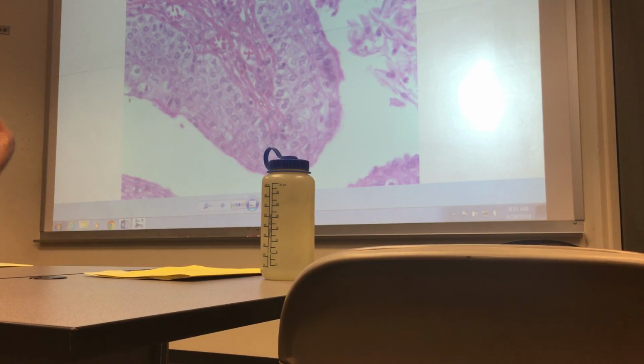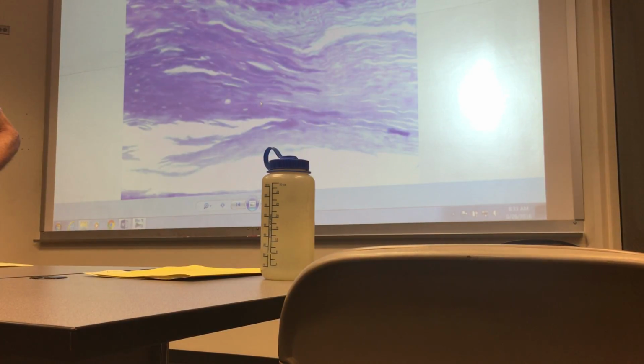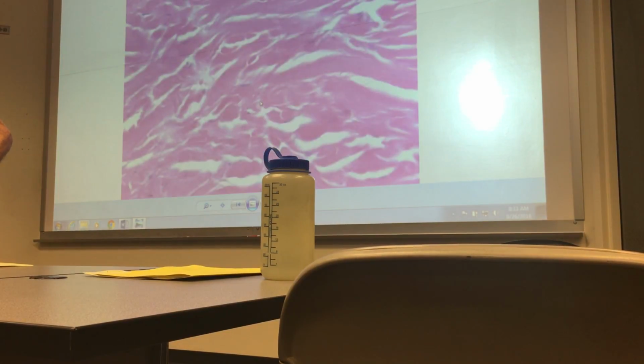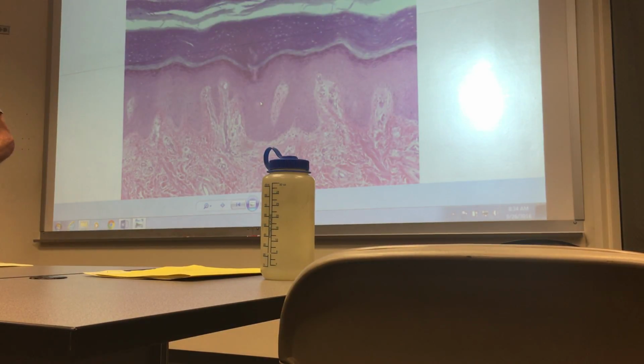Let's go back to the low power of the skin, because just as we did on Wednesday, there are several points I try to make when we look at these things and preparing you for the practical. On Wednesday, one of the points I made was the difference between an organ and a structure.